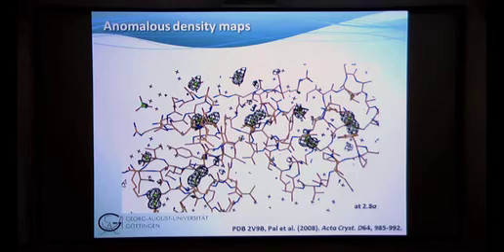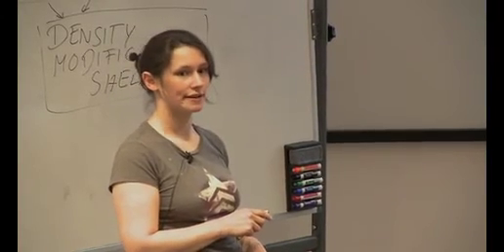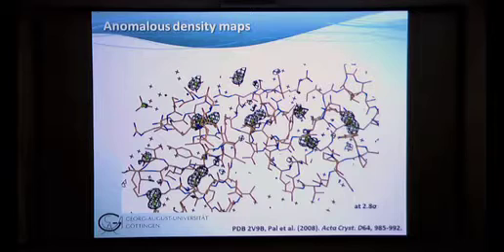However, one doesn't have very good anomalous density. What did you think happened there? Would you think this is really a sulfate? Could it possibly be a quarter of a sulfate? Could be another atom. Yeah, it could be. Could be another atom. Which atom?